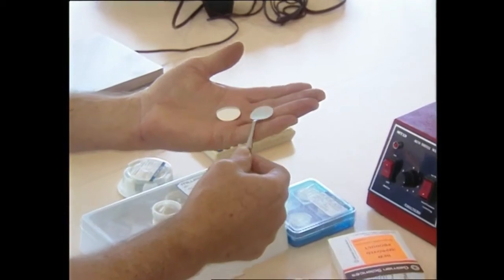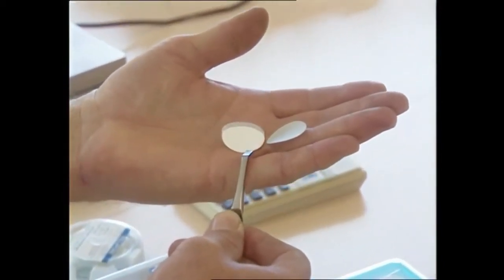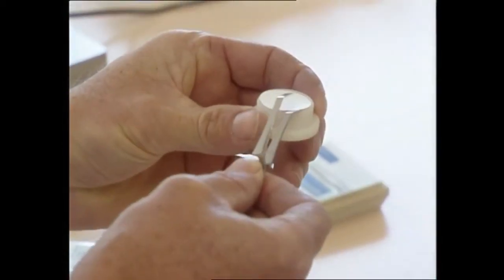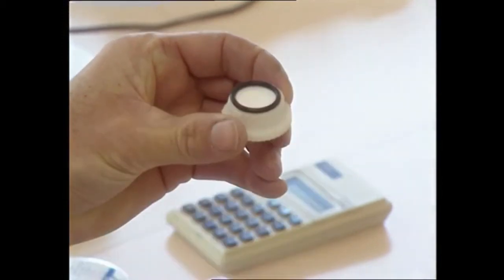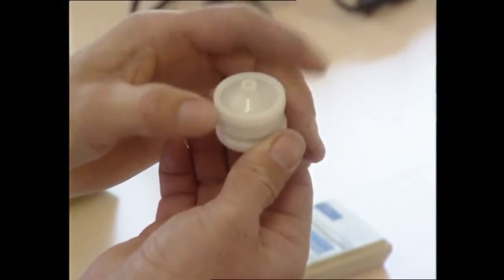In this case, a membrane, which is made of cellulose acetate or cellulose nitrate, with 0.22 micron pore is used. This is used only when we are dealing with compounds which are heat labile, such as some of the plant hormones used in tissue culture, for example, zeatin, gibberellic acid.